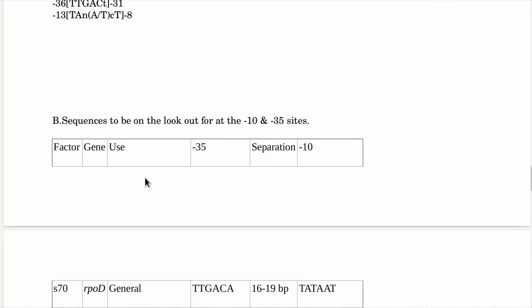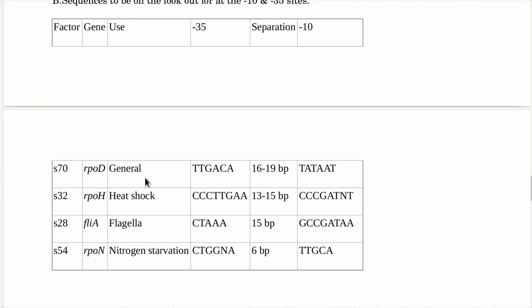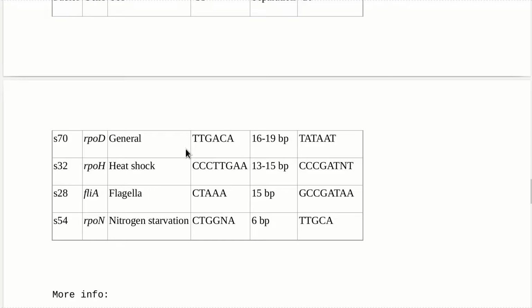Now, these are all of the potential promoters here, and the type. As a general rule, the TATA box is the most common. But if you're looking at a heat shock protein, you're going to look for something like this. If you're looking for the flagella genes, the promoter, instead of a TATA box, has this thing. This looks a lot like it could be a GC box. Maybe this is what evolved into a GC box. And here even, maybe these evolved.